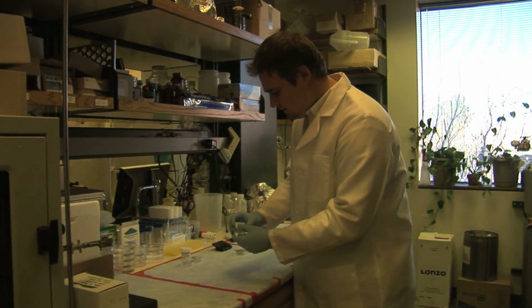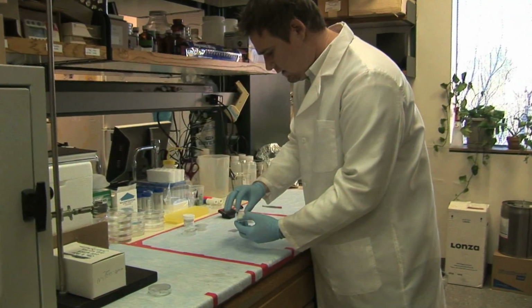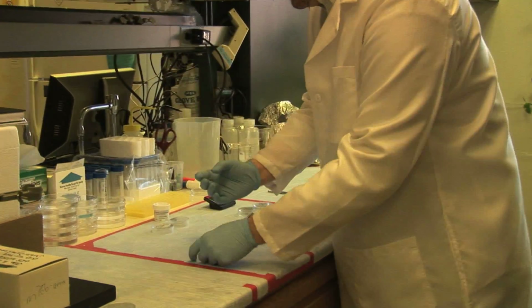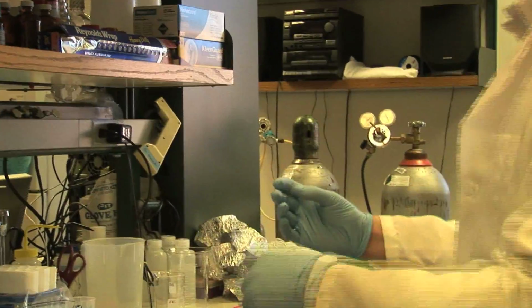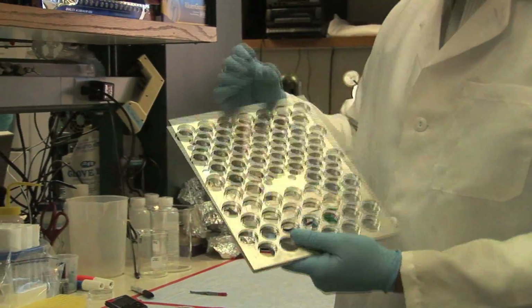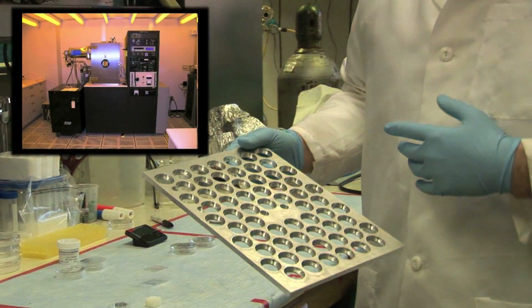To make our surfaces, we start off with cover glass. These are just little pieces of glass, I think a millimeter thick. See it here? It's just a round cover slip. What we do is we've machined these slides, or these samples, where we can insert the glass, and then we take it to our electron beam evaporator.